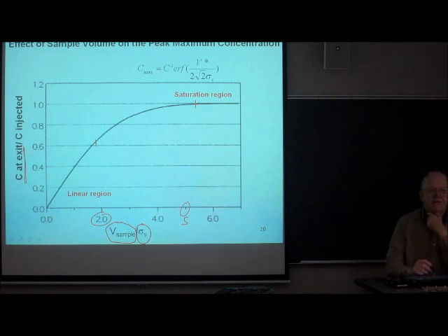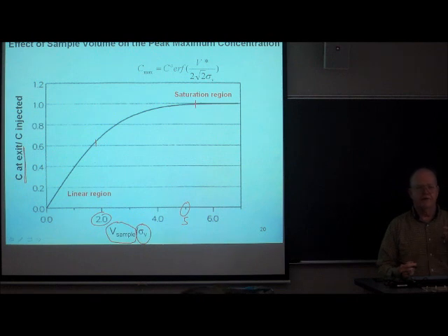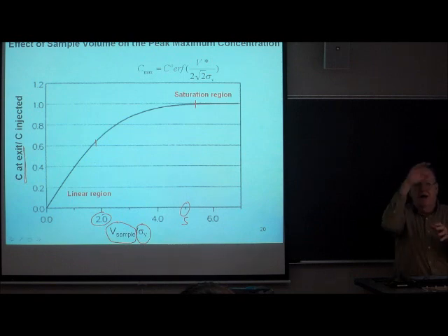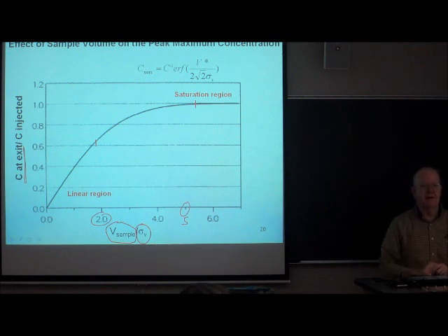This has an awful lot to do with your analytical sensitivity. If you inject a microliter versus a tenth of a microliter, you're going to see a peak which is a lot bigger in area and a lot bigger in height. If you inject a 10 microliter sample, you're not going to see a signal which is 10 times bigger than a 1 microliter sample in height, but it will be 10 times bigger in area. To get a lot of signal, you're always pushing to inject as much as you possibly can. But obviously you can inject too much.